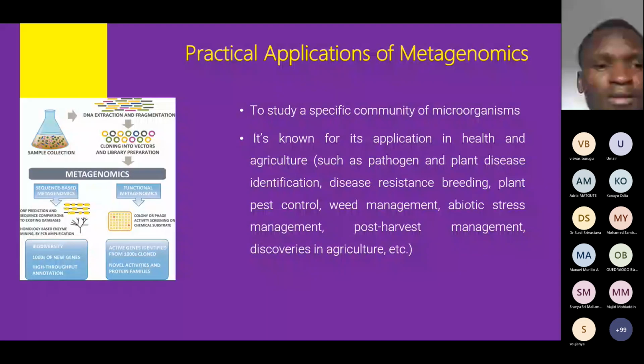According to taxonomic classification, we have from the kingdom, phylum down to the species level. But metagenomics will actually give you full detailed information about the taxonomic classifications of the samples that are present in that environment, and it's just like community based.